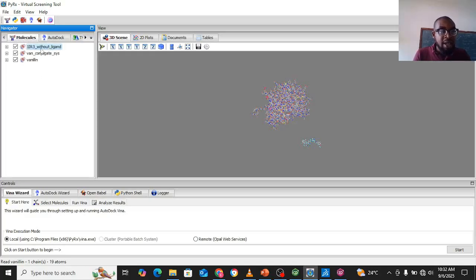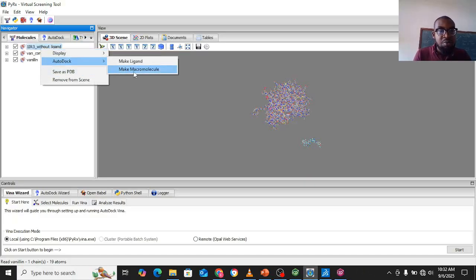This is my target protein. So what you do is right click and then you simply click on make macromolecule.